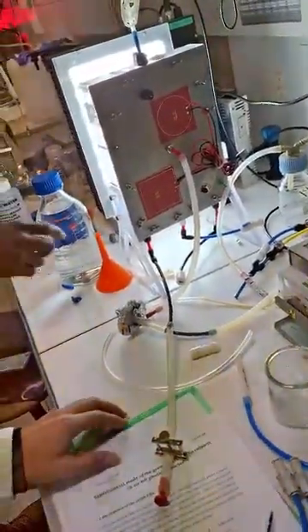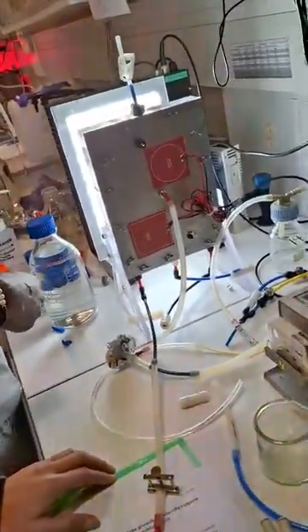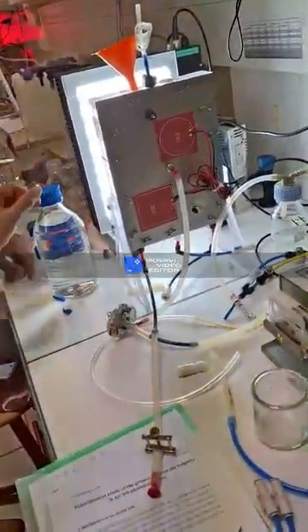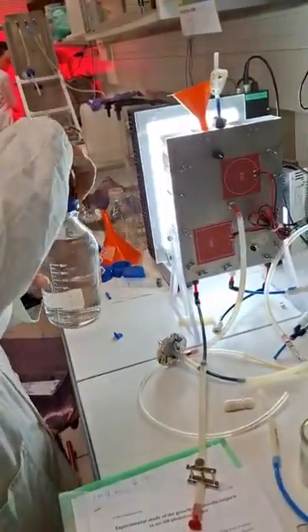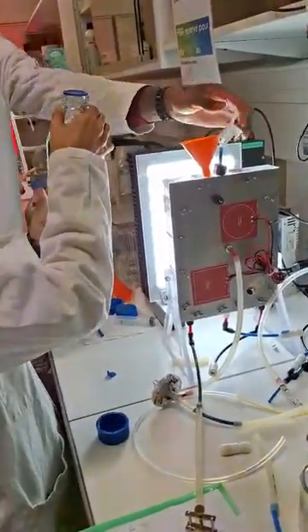Okay, so let's go. We want to try to fill the system. We will use just this. It's a verification, just to be sure that it's not leaking.